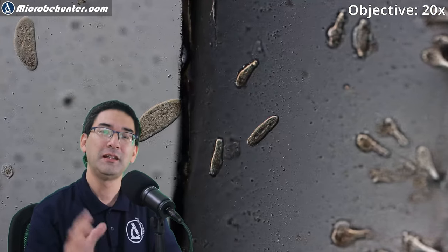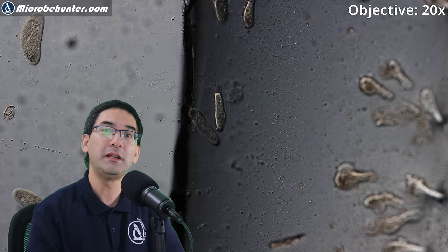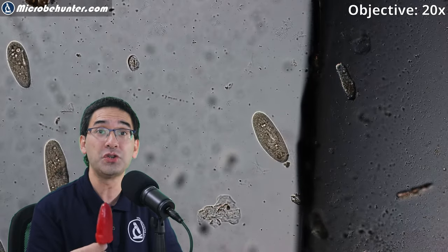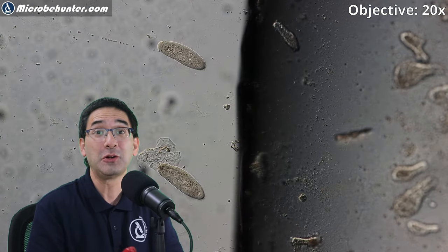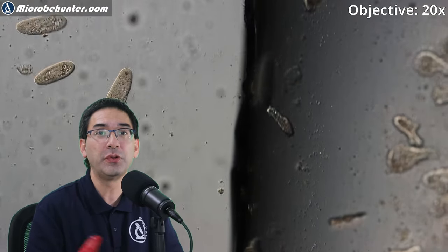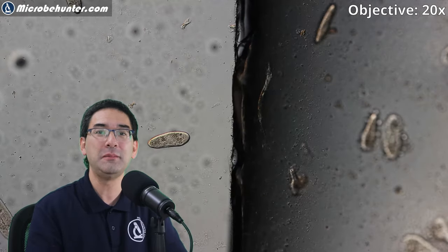Here again, the danger area is on the right side, and as soon as a paramecium moves over it starts to spin. Now, is it actually the capsaicin or could it be another substance? Maybe other substances are involved, but we know that capsaicin has a highly disinfectant function — and therefore spicy food can be stored much better. In warm regions of the world, people often eat very spicy food because it prevents the growth of microorganisms.